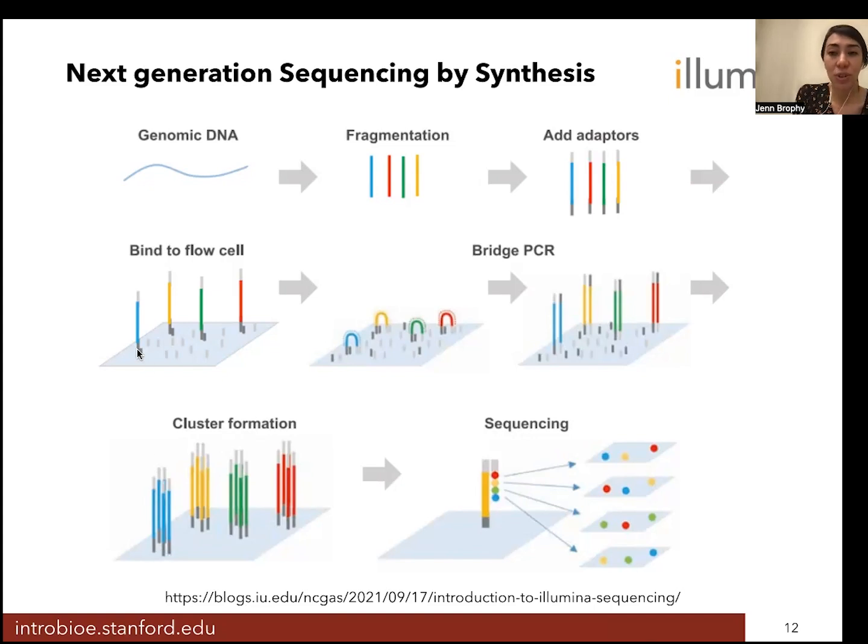It's really difficult with this Illumina method to sequence a single molecule of DNA, so they do amplify it in this location. We can talk about how this bridge amplification works if you're curious, but I think it's sufficient to just know that it occurs and it gives you clusters of DNA that's all identical in little locations along this chip.